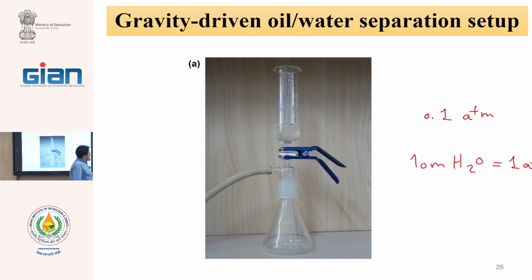Therefore, in this height that is mostly 30 centimeters, not very high, with very, very low gravity-driven pressure, due to we have a very big pore size. For example, if the membrane is hydrophobic, oil passes and water not.